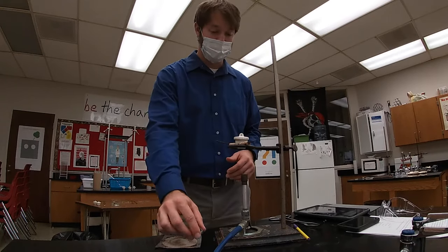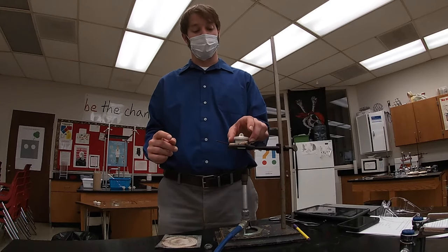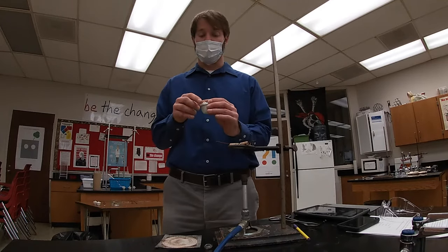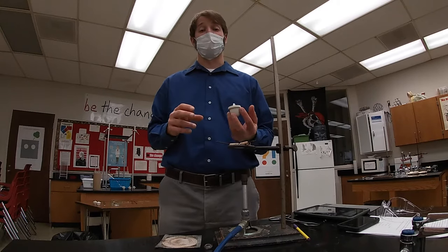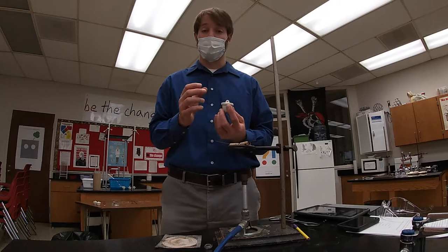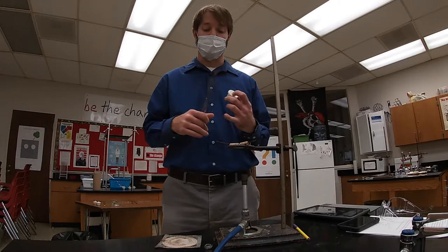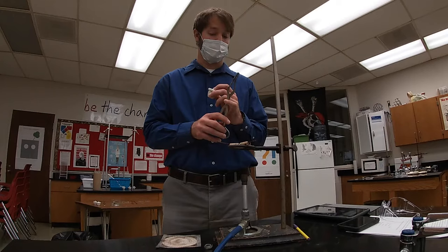Next, I want to get the mass of my empty crucible. Once I get the initial mass, I don't want to touch it again with my hands because the balance we're using has a level of precision that can actually measure the mass of the oil from my fingerprint, and it would throw off the mass. So pretty much from this point forward, I want to be using crucible tongs combined with wire gauze to move around my crucible.